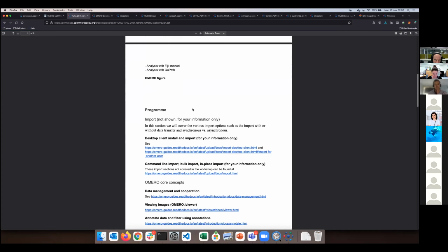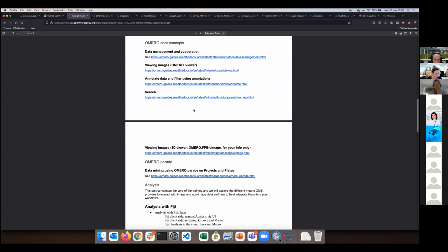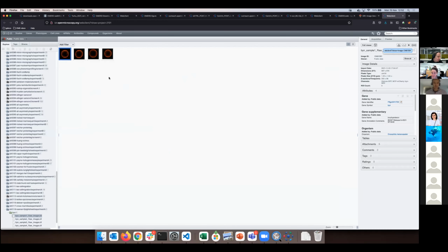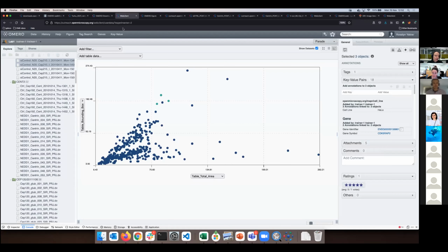I'm just checking if I made any omissions. I didn't show you the 3D viewer. If you really want to see that, we can go through it, but I think the questions and the feedback are now much more important. So thank you very much, and see you tomorrow. If you want to ask questions now, then please do so. Very welcome.